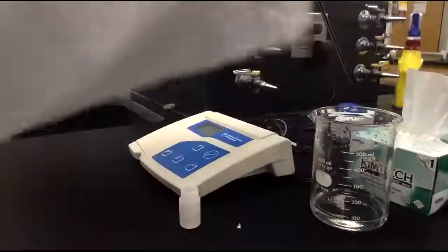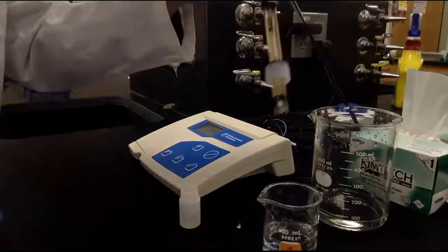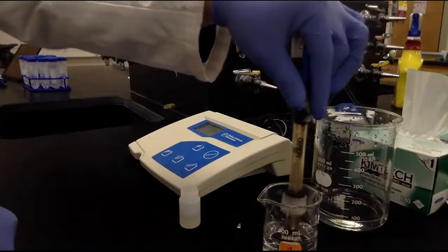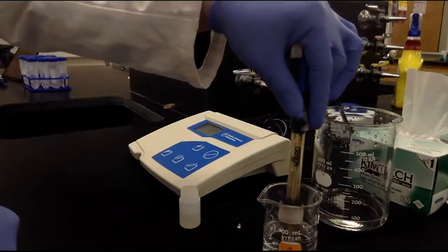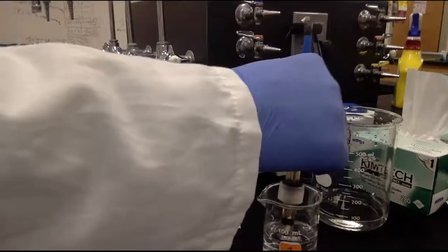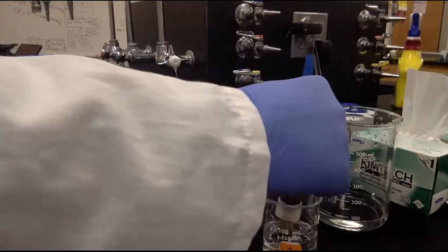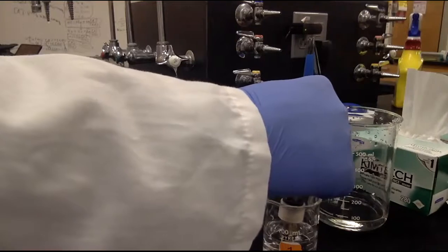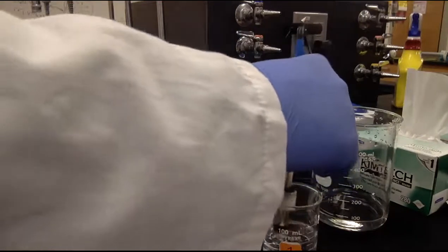Okay. After that, you just grab one of your buffers you made, and you put your probe in the buffer, and you record the pH value here. Okay. So it's your turn. Right. So the pH is 7.1. Okay. Record that number, and you do the rest of the measurements.